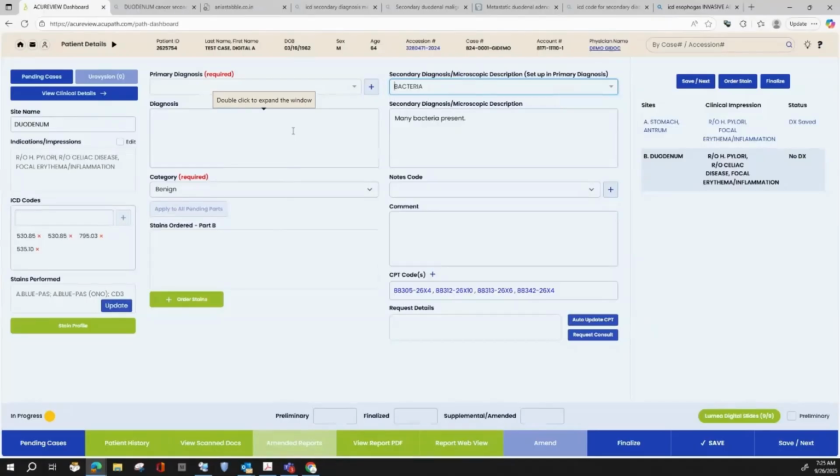That's how they work. Please remember that the diagnosis templates are your own. So you're responsible for your own templates. You can edit them, add them, remove them as much as you want. Many of you have asked to have templates that were from some other pathologists. So you may have gotten the other pathologist's templates. Once you get that list of templates, then it becomes your own. And then when you modify them, they're just yours, and the other pathologist doesn't see the changes that you've made because they're your set of templates. So whatever you need to do with them, whatever you want to do with them, that's up to you. You can make whatever changes you want. And that's it on the templates.